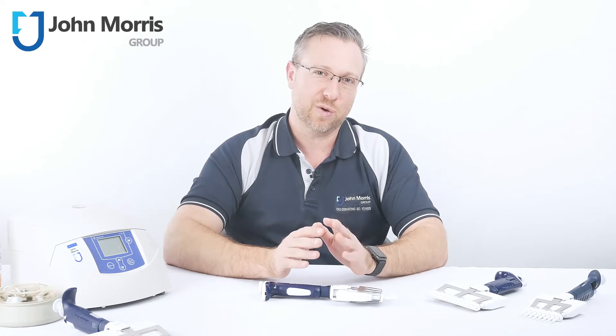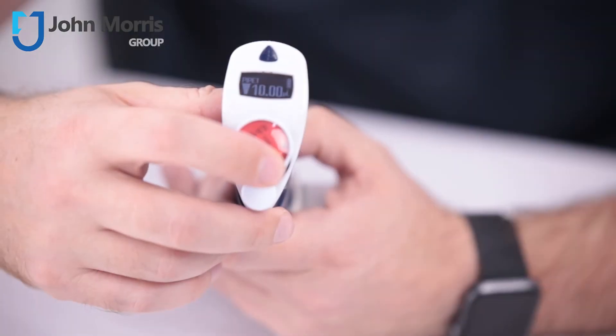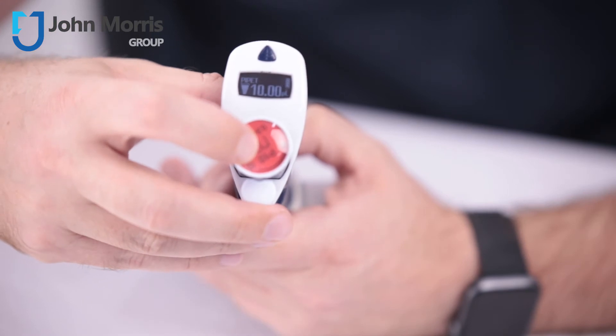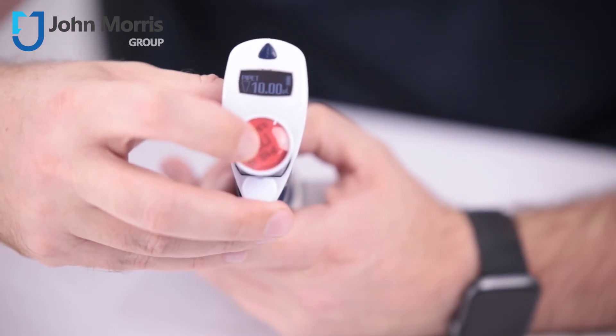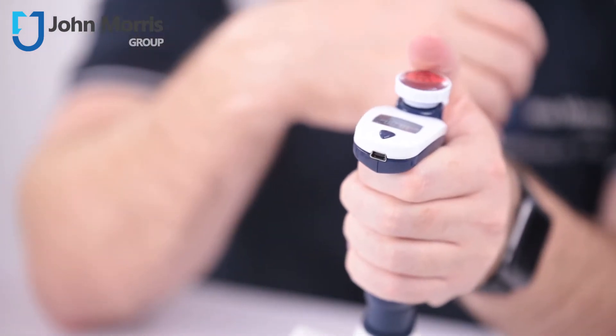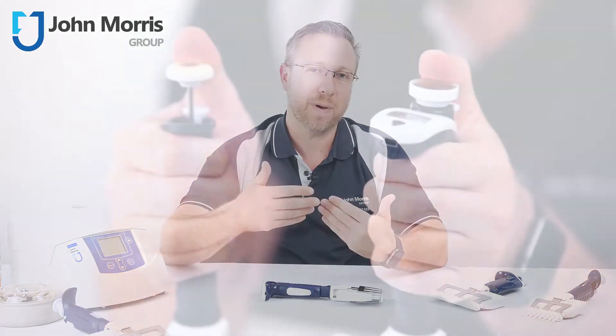There are a couple of advantages to electronic pipettes like the Gilson M-Series. Firstly, they virtually eliminate user interference. Changes in the rate of aspiration or dispensing from run to run can influence reproducibility and your results. On an electronic pipette like this one, the speed of your thumb is not related to the inner workings of the pipette. Once you click the button, the Gilson pipette will aspirate and dispense at the preset speed selected in your protocol every time. This means zero user-to-user pipetting differences and the option to switch hands without affecting your results. The Gilson M can literally halve your random errors and reduce systematic errors by a similar margin compared to a manual pipette.